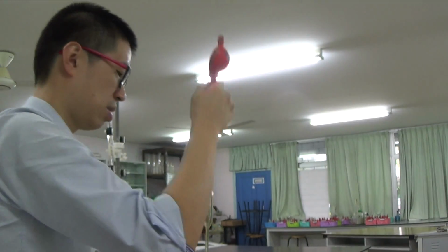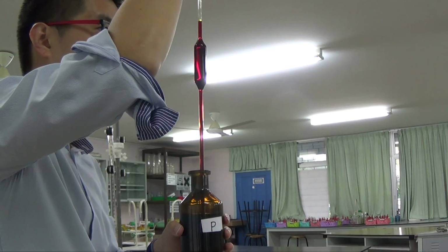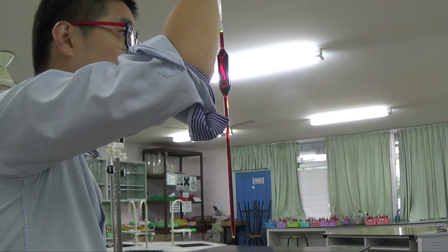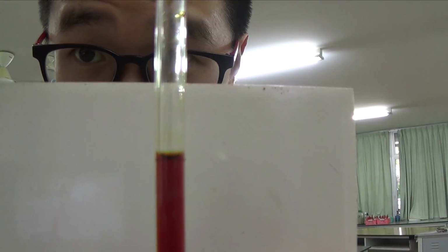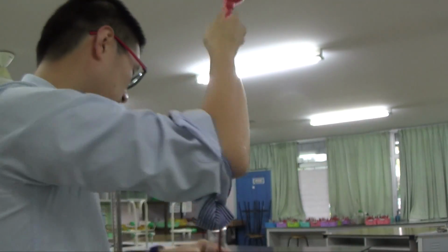So what I'm going to do now is suck out the second portion of my 25 cm cube so that I can do my first rough titration and the second exact titration here. Just very quickly, avoid parallax error, eye on the eye level as you're reading it. Not too sure if that's well focused. Right below the meniscus, there's 25 cm cube there. So put it in the conical flask and start pressing E, eject.